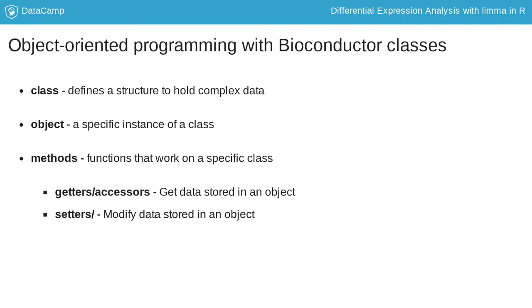The core Bioconductor classes are in the package Biobase. If you've used any Bioconductor packages, you likely already have this installed. However, to specifically install it, you can follow the standard Bioconductor installation process by running these 2 lines.